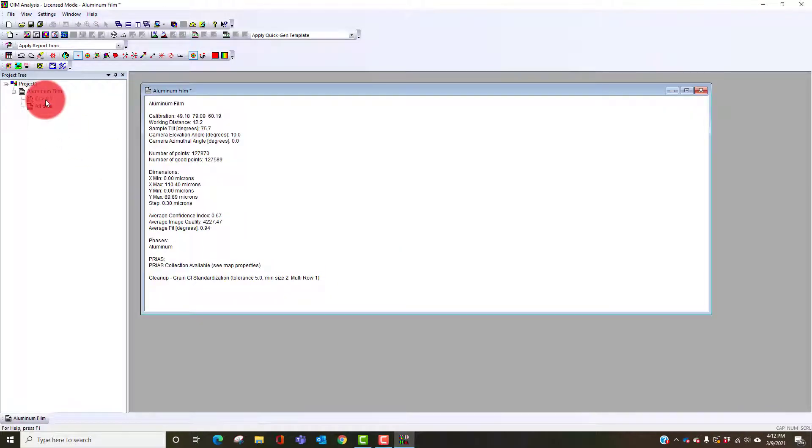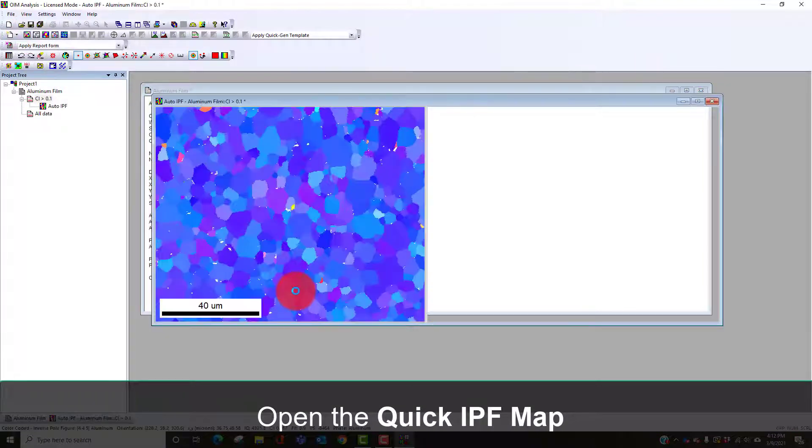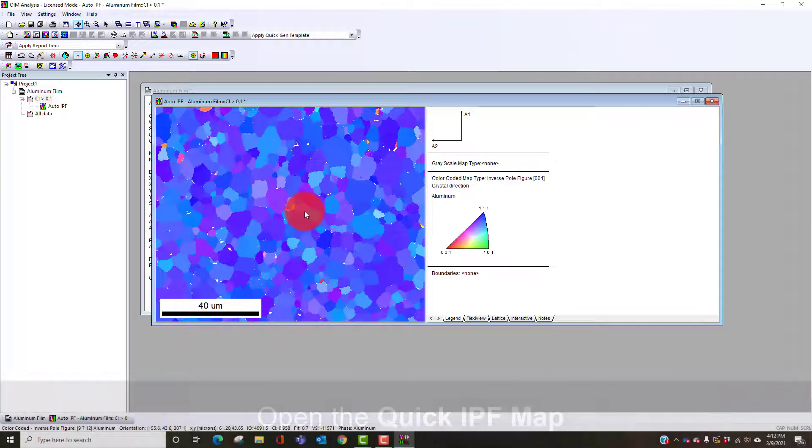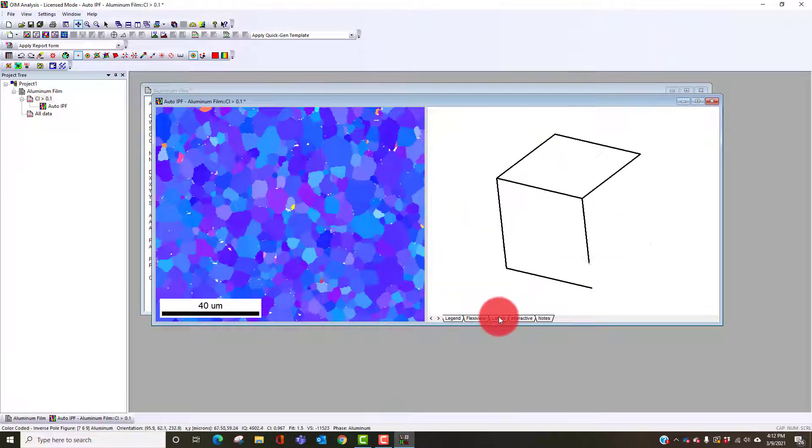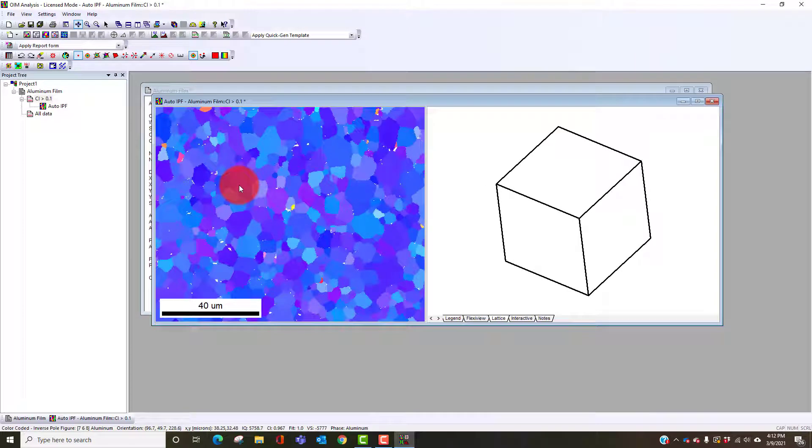We can look at the orientation map. You can see here it's mostly a blue one-one orientation. If we look at the lattice as we move through here we can see where they change.